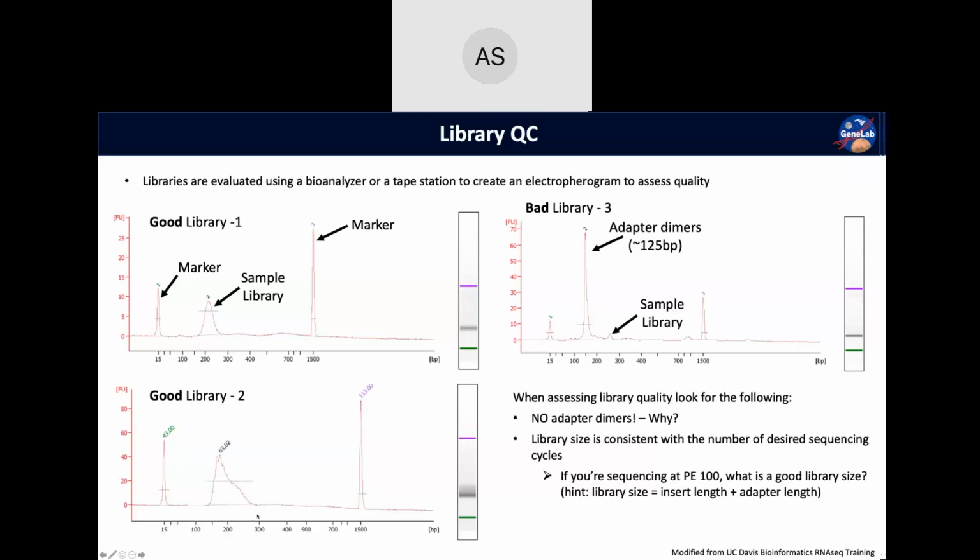Especially because of the filtering we do, there's about, I don't know if Marie's on, but I think there's around a 100 to 200 range in the pores for the size filtering. Is Marie on?